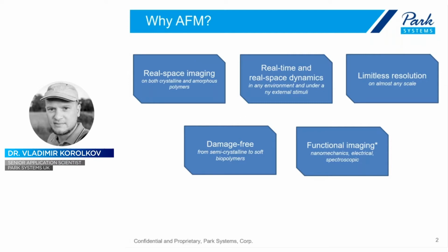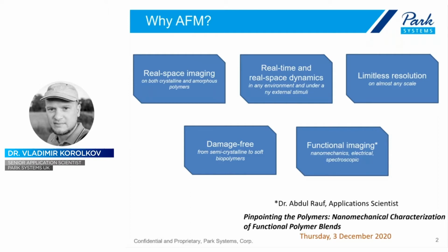So, that aspect of imaging will be covered in the following webinar in about a month's time, delivered by Dr. Abdul Rauf. We'll talk about nanomechanical characterization of polymer. So a great question is, how come, having so many unique advantages, AFM is still not really used for structural studies of polymer? That is a very good question.